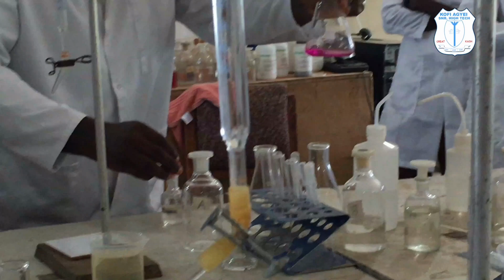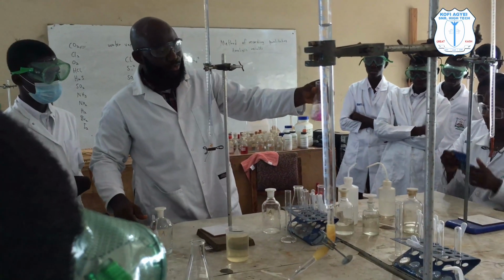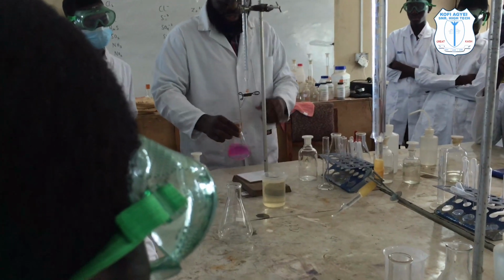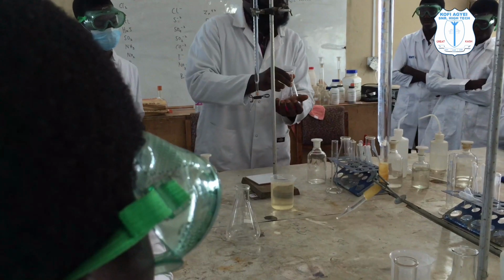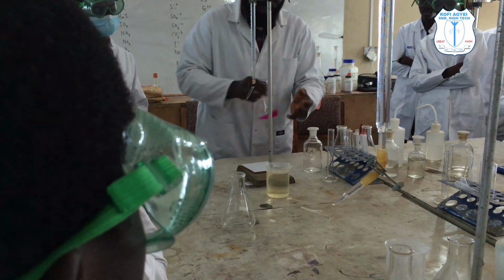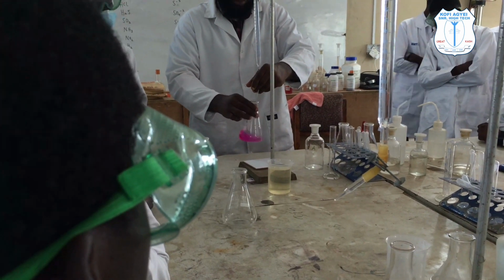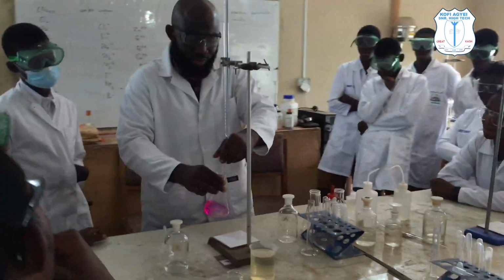Please, what color are we getting? Violet or what? Purple. So here you're going to do the titration until the purple color is discharged, or the purple color becomes colorless. Understood? But as I said, you have to swirl for the reaction to take place. Now you're going to read everything in what? In drops. Understood? Yes.